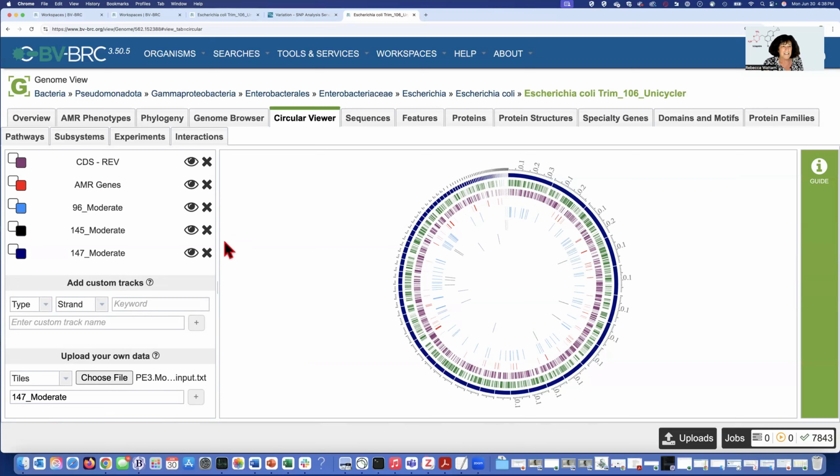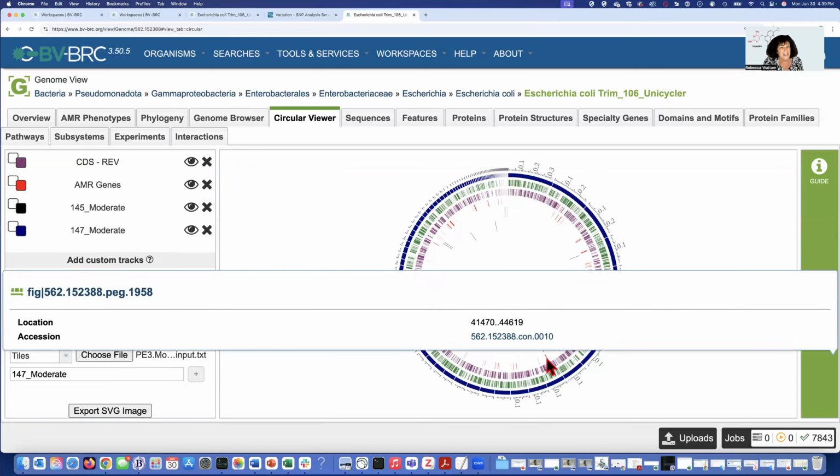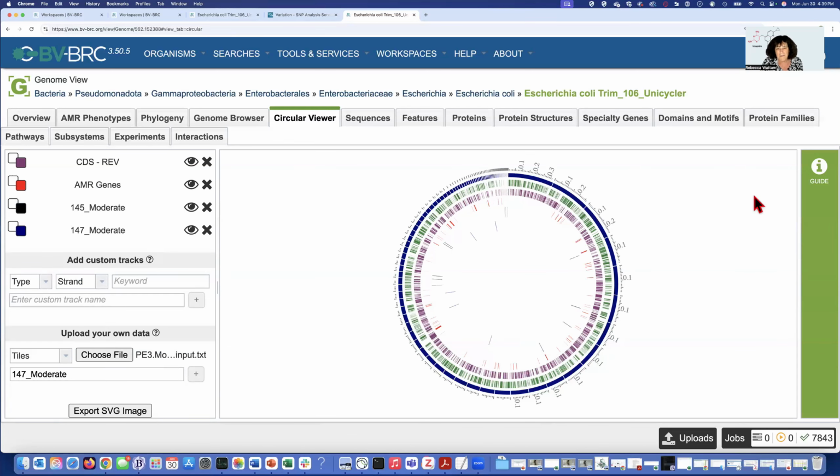So at this point, I could say, you know what, this isn't going to help my story for my publication, my presentation, my grant review. So I'm going to get rid of it. And then you can see more of where those things are, where they're shared. So there are certain areas where they do line up. If I can sneak in there, you have to be very cagey in the way you go over there. There's a mouse over that shows you that, but you can see who's shared and who's not.